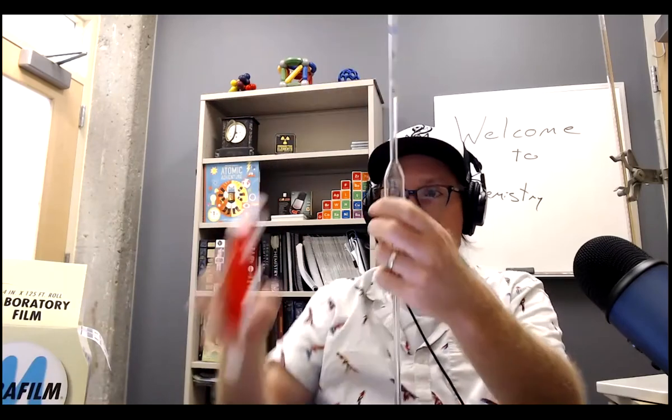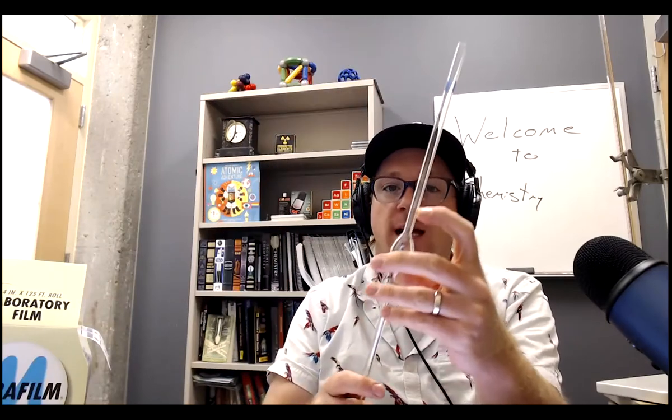So this is the pipette. There's another line here. This helps us measure exactly, this one's for 25 mils from one container to another. And we're going to make 100 mils. So that's enough for probably only 3. And you want to do 3 trials today. So you pour it off into a beaker.